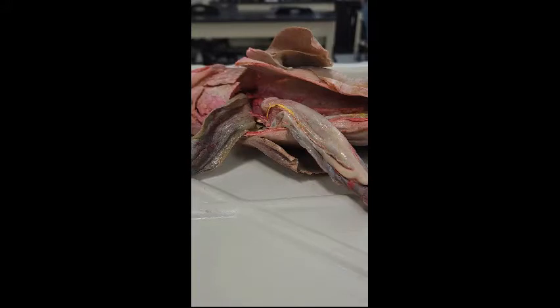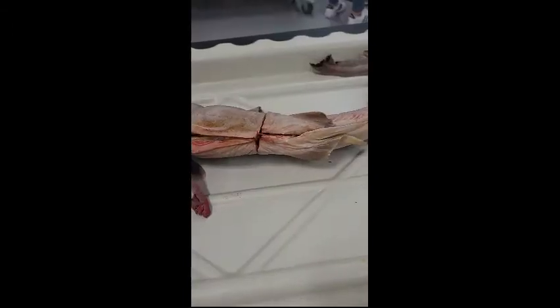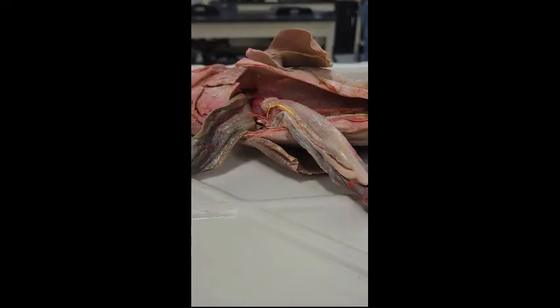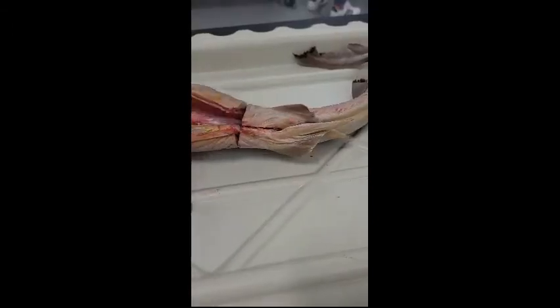Now will be objective number 5, which is explain how sharks reproduce. Include a description. So these claspers will tell us that this is a male of the female and male shark reproductive anatomy. So we will look at male anatomy first.